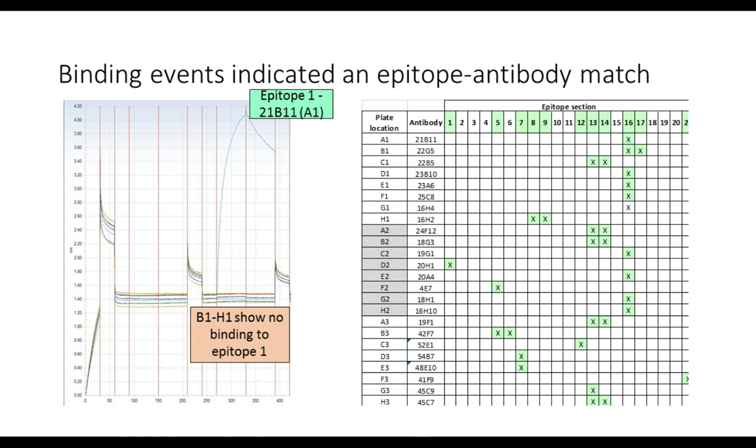So we basically now bin the antibodies into different epitopes. Sometimes you see 2 binding events because we designed 2 layers in order to also cover the regions where one epitope peptide basically touches the other one. So we just did 2 layers of peptides. This is why you can see 2 binding events.